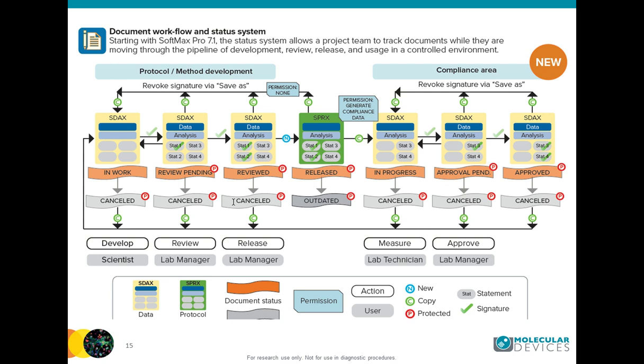Thank you. Does the software now allow identification of the instrument serial number being used to collect the data? Very good. I see we have a lot of experienced users here in the audience. So for the newer instruments, we do have the option to actually have that included. For the older instruments, such as the M series, that would require a firmware update. If you absolutely need that, we can refer you to our custom department, but we don't have it in the pipeline currently, but the new readers are capable of doing that, yes.